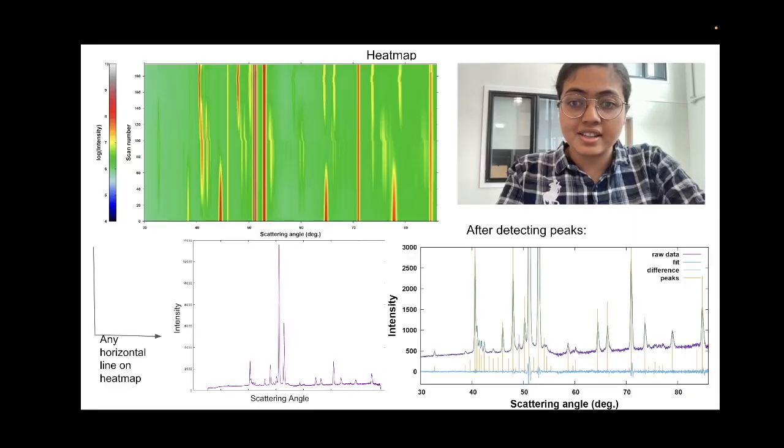Diffractometry is a technique used in a multitude of applications, from the structure of proteins to material science, mineralogy, and geology, to identify crystal structures. In our project, we are looking at X-ray diffraction in the context of high-performance batteries.